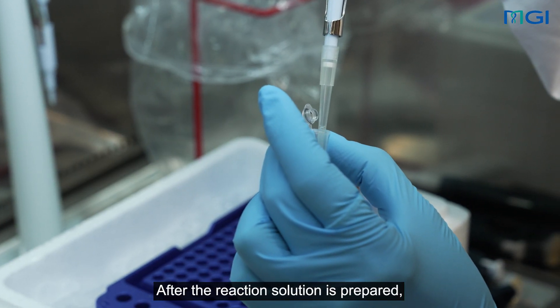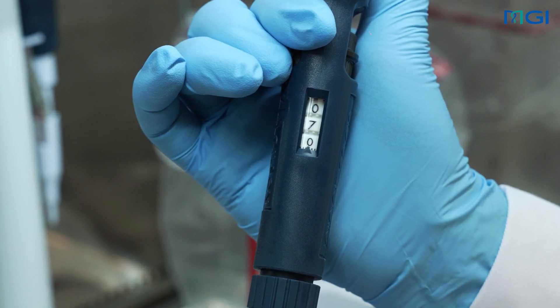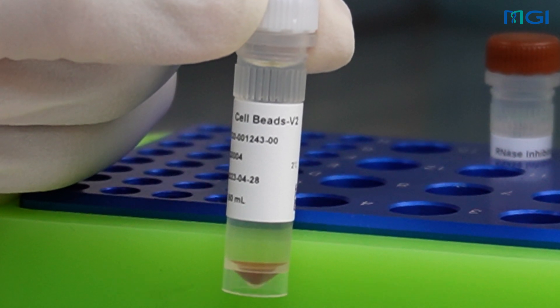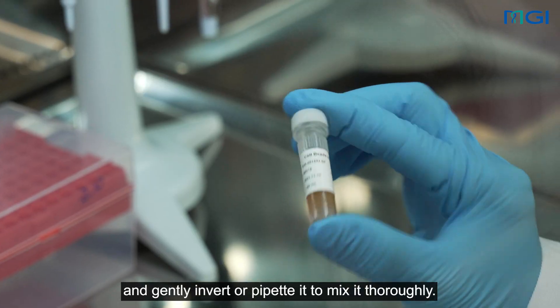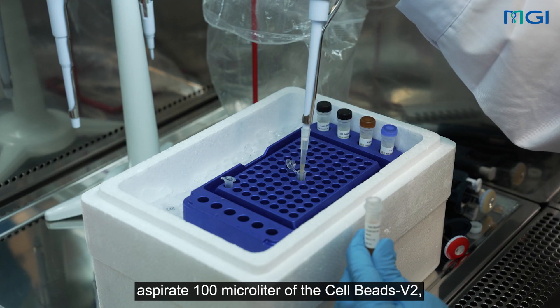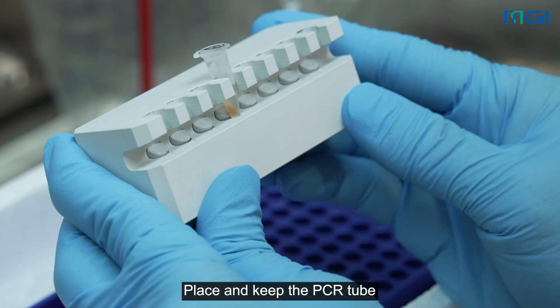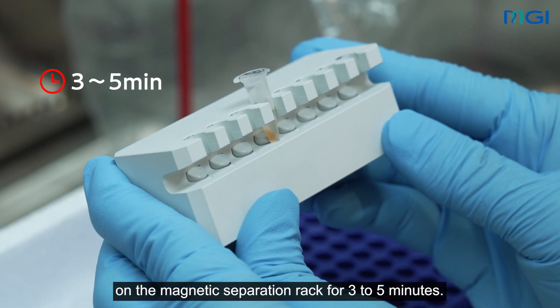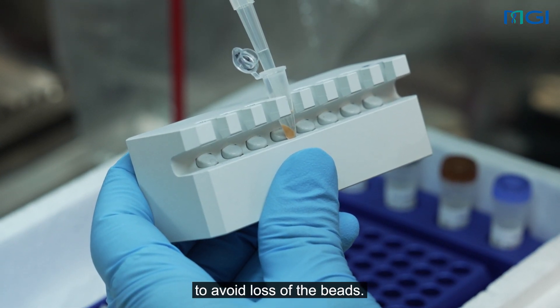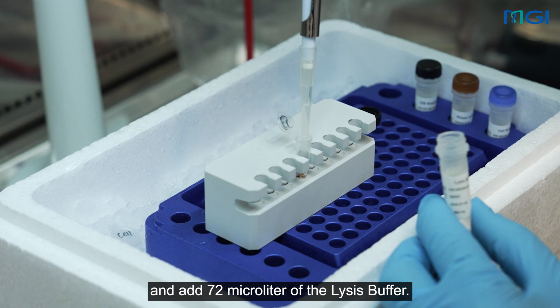After the reaction solution is prepared, gently pipette it to mix thoroughly by using a pipette with the measurement range of 70 µL. After the cell reaction solution is prepared, proceed with the preparation of the bead suspension. Take out the cell beads V2, and gently invert or pipette it to mix it thoroughly. For each sample, aspirate 100 µL of the cell beads V2 and transfer it to a 0.2 mL PCR tube. Place and keep the PCR tube on the magnetic separation rack for 3 to 5 minutes. Gently remove and dispose of the supernatant, to avoid loss of the beads. Remove the PCR tube from the magnetic separation rack and add 72 µL of the lysis buffer.